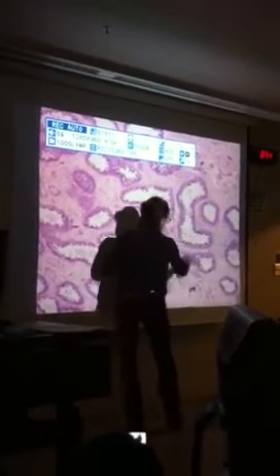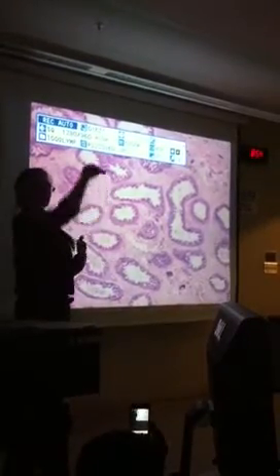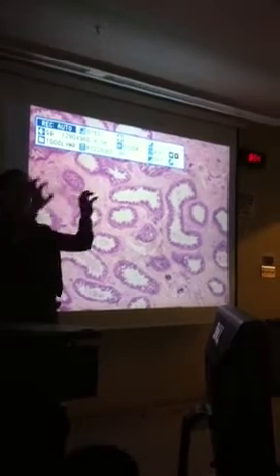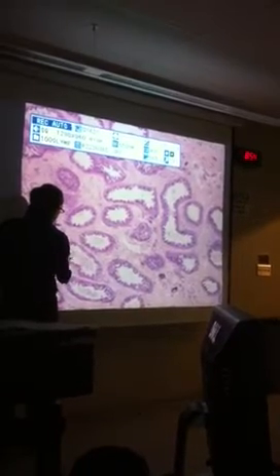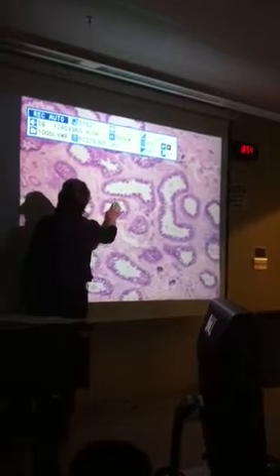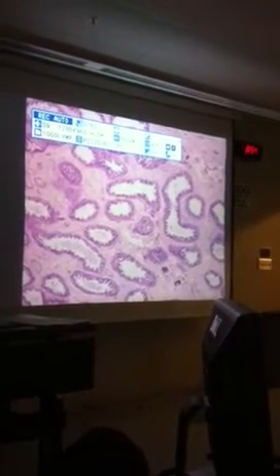So all of those circular areas are the tubes that the sperm is swimming through, right? And so you cross-section it, and you just see all these little circles. And a lot of these, you see sperm, so that's what all of this here in the middle is. Those are all sperm.